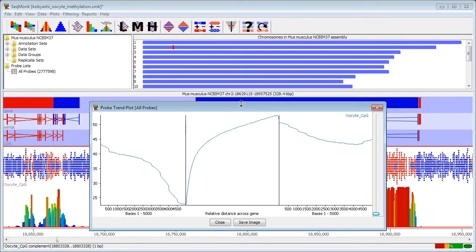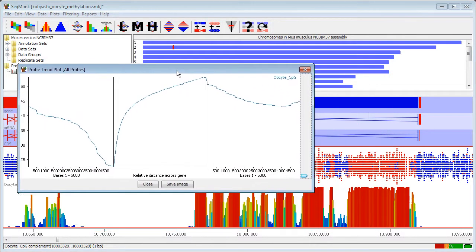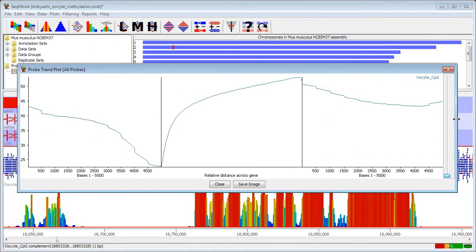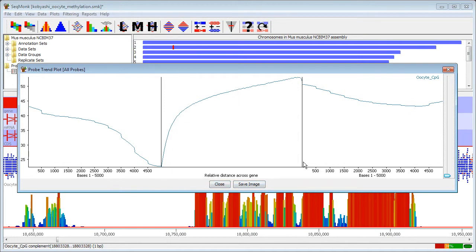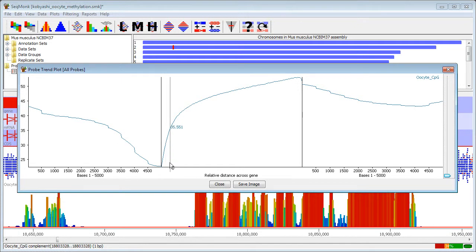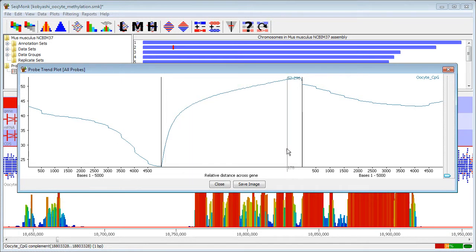So here you can see the plot that's been generated. If I expand this a little bit you can see the central portion represents the methylation of the gene and in this case I have a methylation that increases continuously throughout the length of the gene body.